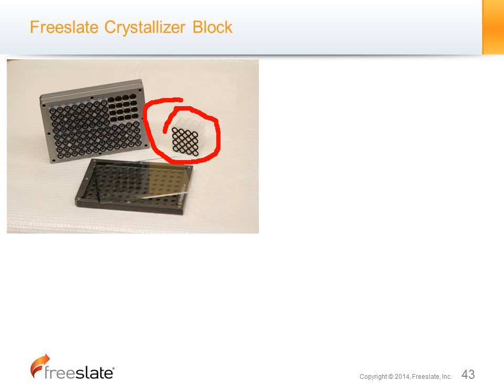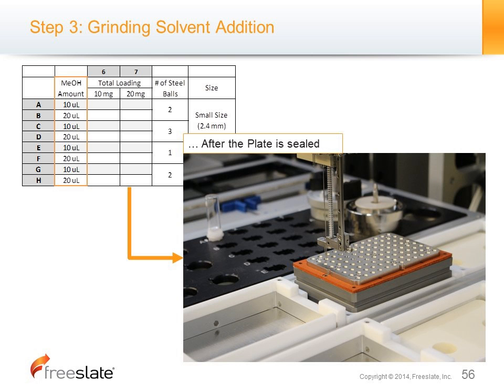So pretty much after it's sealed, and you can see here it's sealed, you really don't have to worry about solvent evaporation. Not only do you have this rubber gasket, in this case you have a PFA sheet, or sometimes you can use a Teflon sheet, and you seal the whole component inside. But the milling is definitely with 2 medium-sized balls inside, vortexing. By vortexing, the milling takes place, and the RPM we use is 900 RPM.